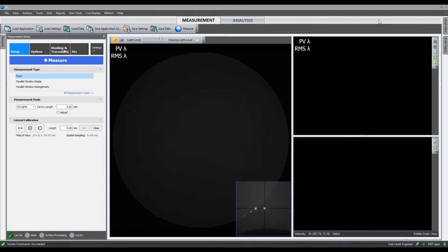So you'll see some things that are special to the MST in the webinar today, but most of what you'll see is going to be pretty standard for all piezo style interferometers that could be upgraded to MX 8.0 when it releases. So without further ado, let's get started.